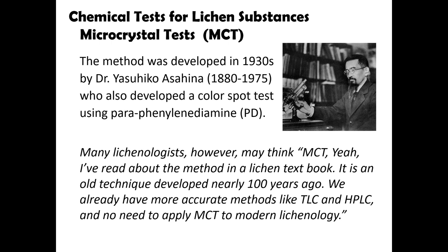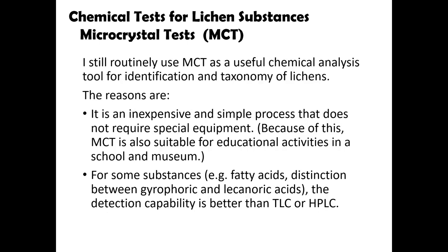Many lichenologists, however, may think, microcrystal test, yeah, I have read about the method in a lichen textbook. It is an old technique developed nearly 100 years ago. We already have more accurate methods like TLC and HPLC, and no need to apply MCT to modern lichenology. But I still routinely use the microcrystal test as a useful chemical analysis tool for identification and taxonomy of lichens.